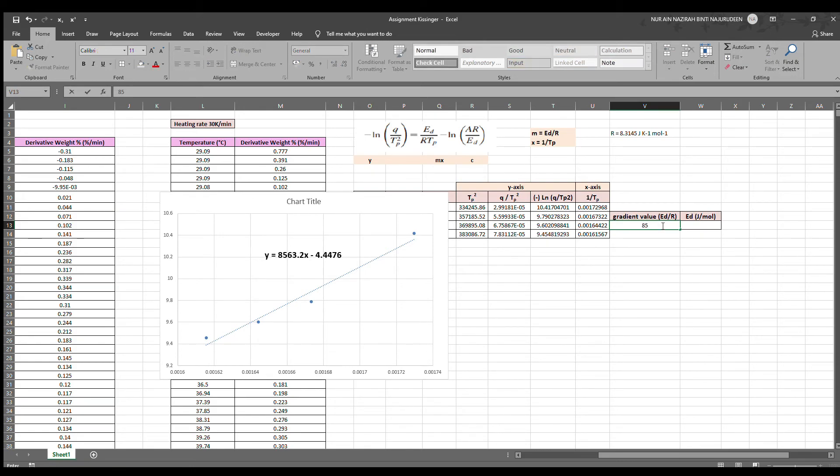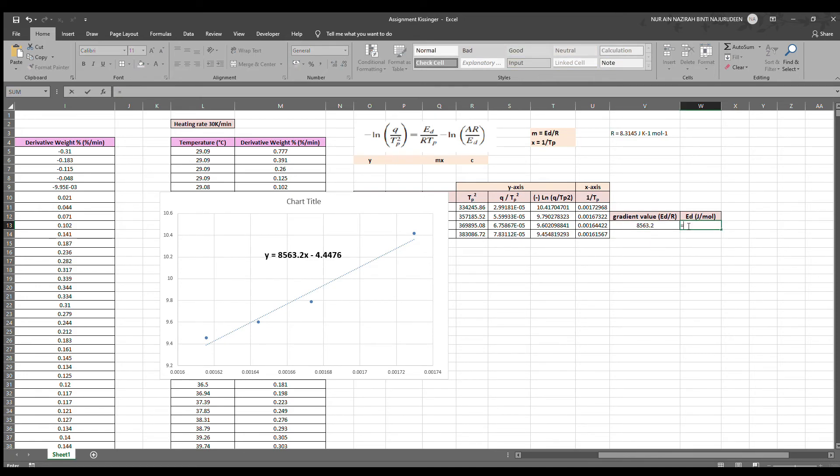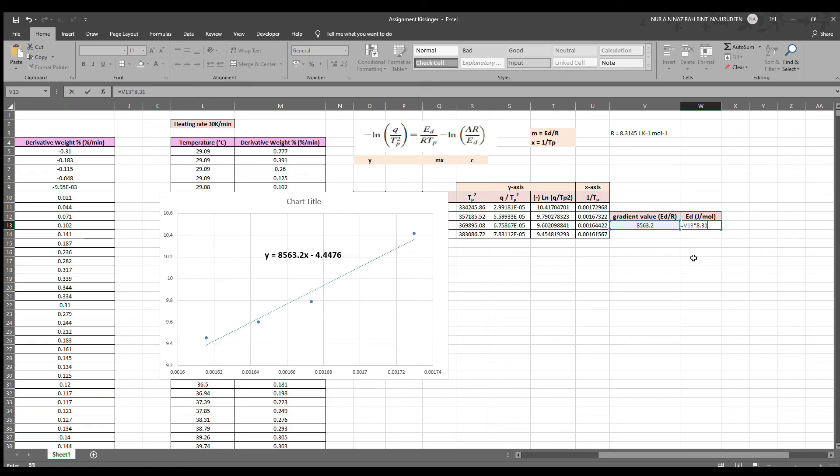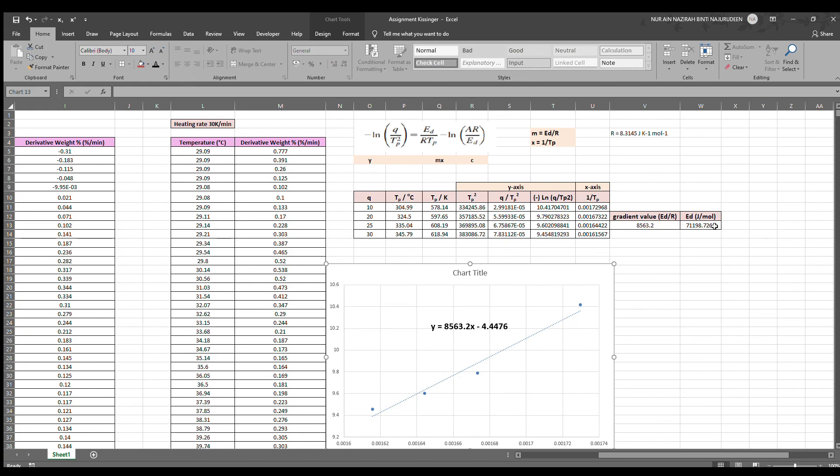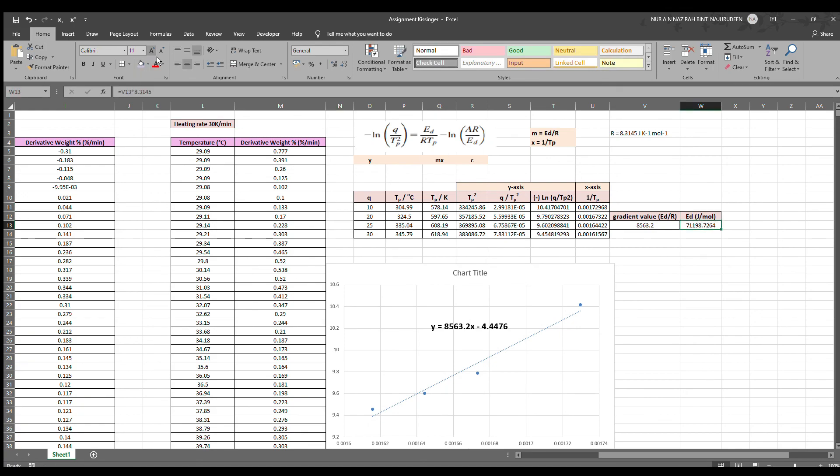To obtain the activation energy, this gradient value that we have gotten from the equation is multiplied by the gas constant 8.3145. This is done because the gradient is actually ED over R and we only need ED, so that is why we multiply it. We will get the answer and I will highlight in yellow to indicate that is the final answer. This is how the determination of activation energy of decomposition is done using Kissinger equation on Microsoft Excel.